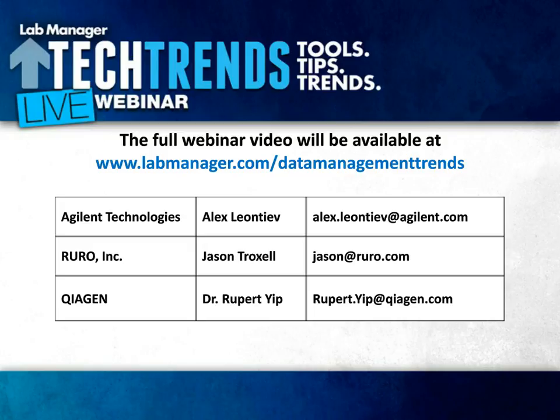Okay. The only thing I'll add, I'm not sure whether the update process was what was being referred to, but in our configurations, we certainly have the ability to add review processes into any of the workflows. So, for the frequency, we would rely on a laboratory, and whatever regulations they're trying to comply with or policies they have, to identify that.